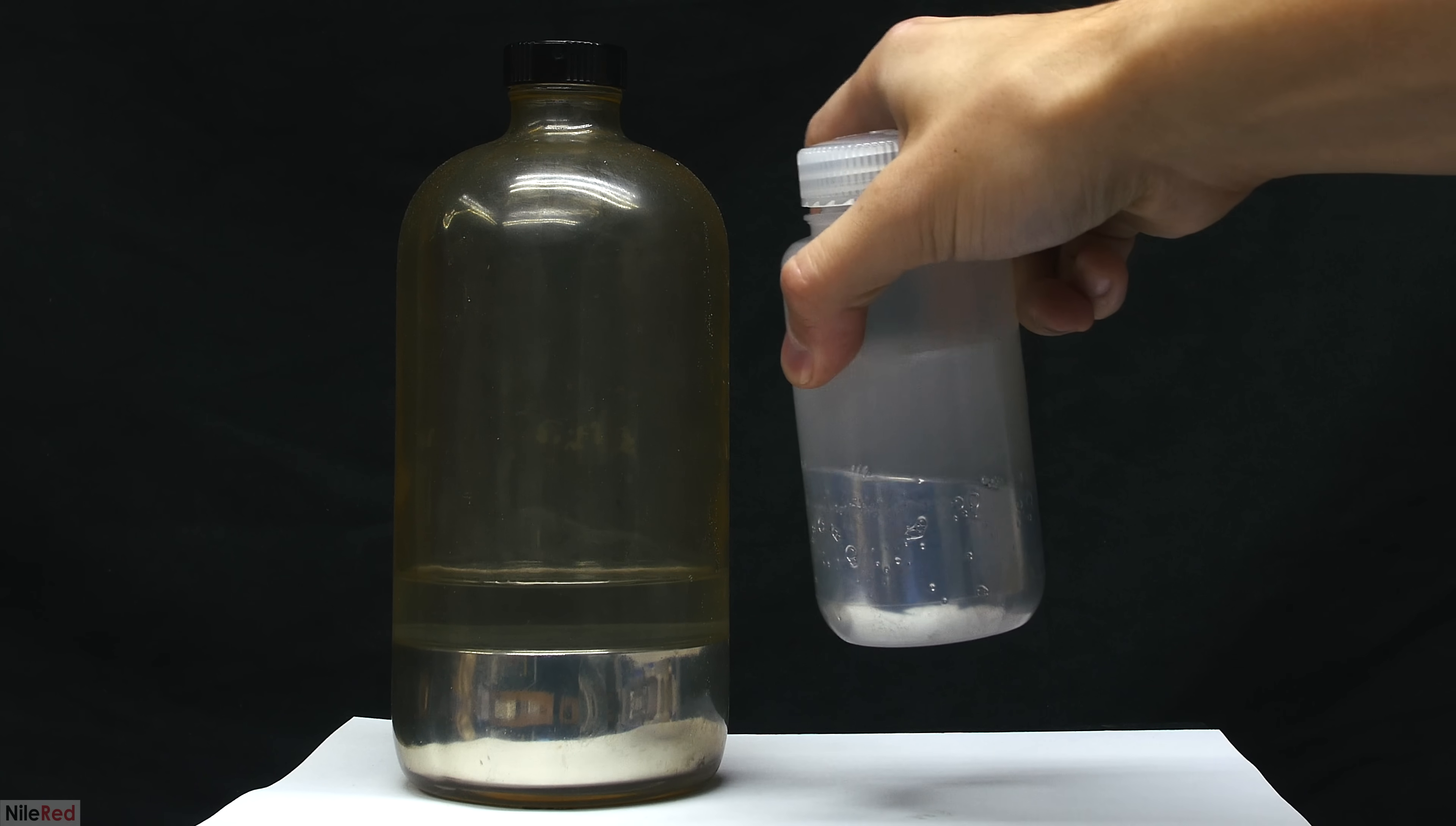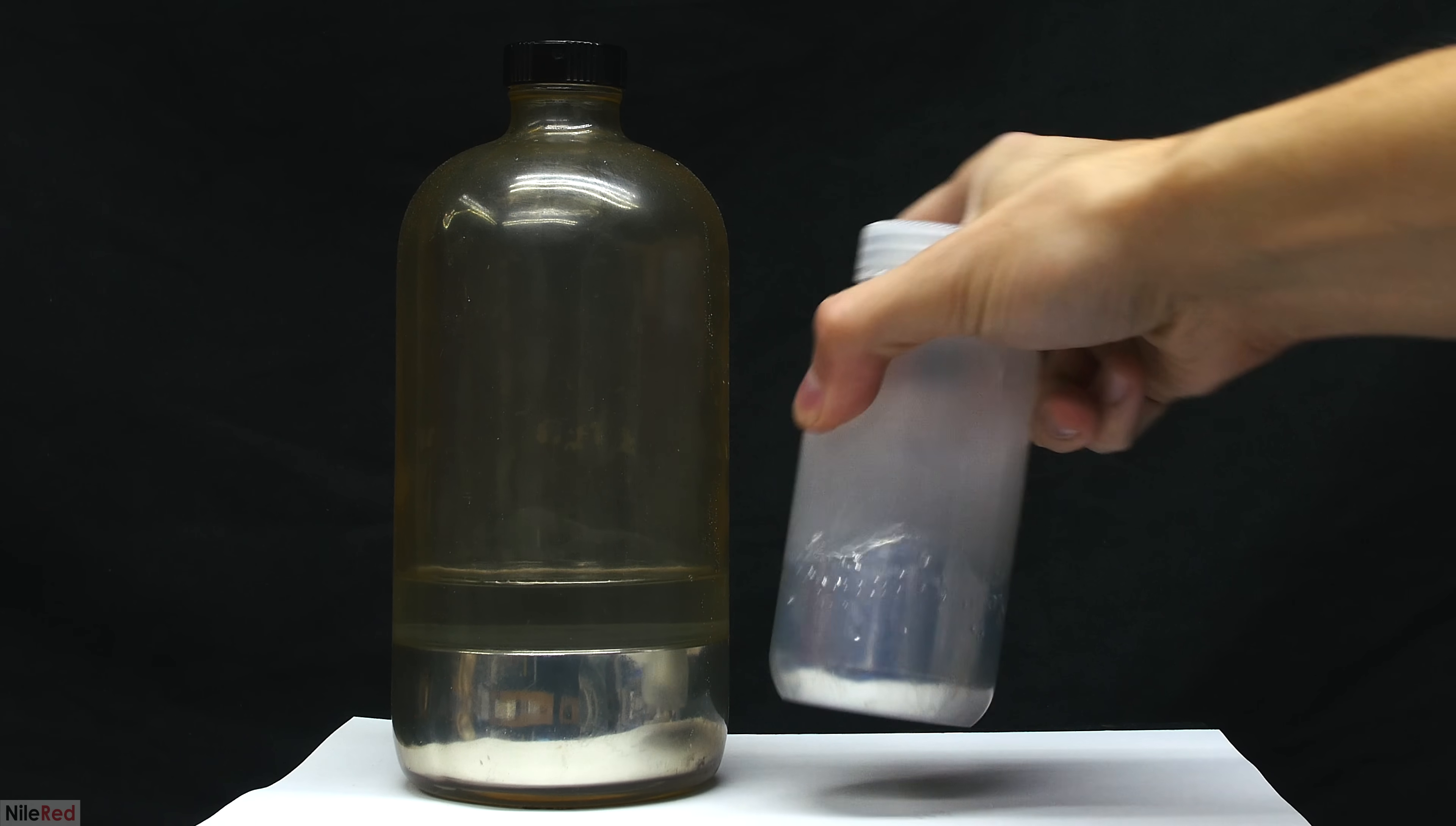If the mercury were stored without water above it, mercury vapor would fill the entire container, and when I open it, it would be released into the air. Without the water, it's also much more possible for mercury vapor to passively leak out of the container.